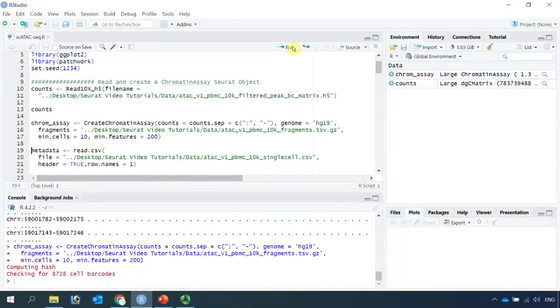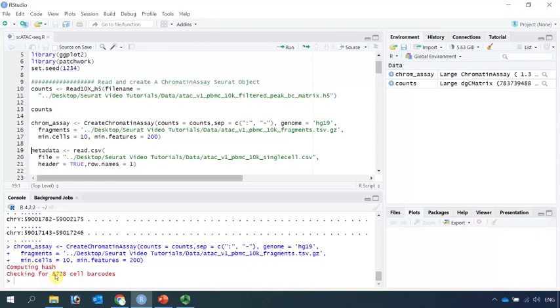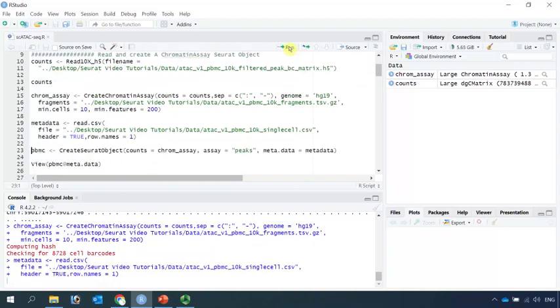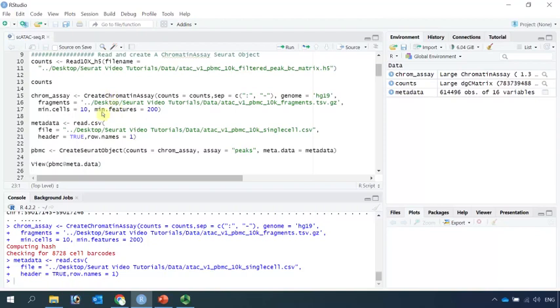You can see here we have chromatin assay containing 8,728 cells. Now we can read the metadata in. We have the count matrix and the metadata. We can create a Seurat object. The counts are chromatin assay. We create a Seurat object as PBMC.